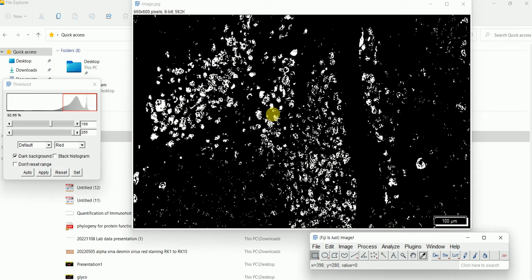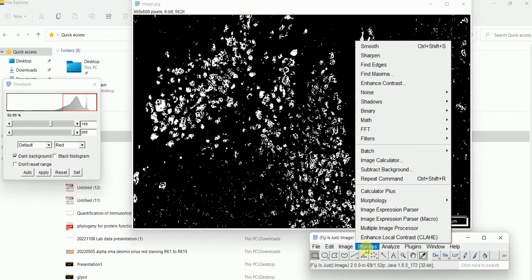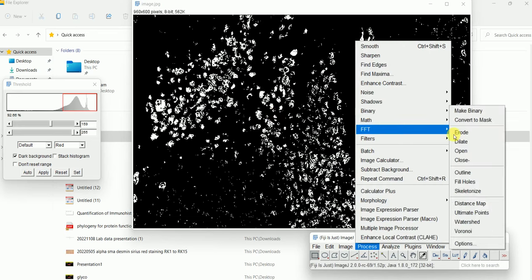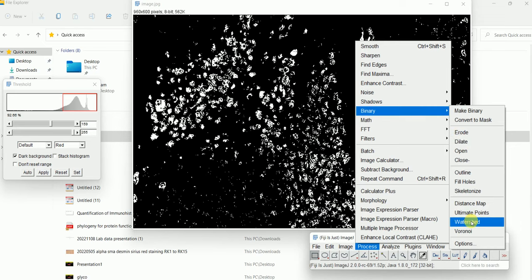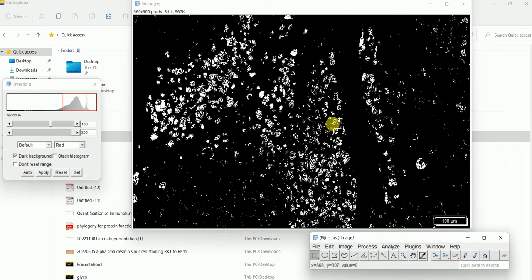Afterwards, go to Process, then Binary again, then Watershed. We use Watershed because we want to separate particles that are touching each other — they will be separated when we apply Watershed.